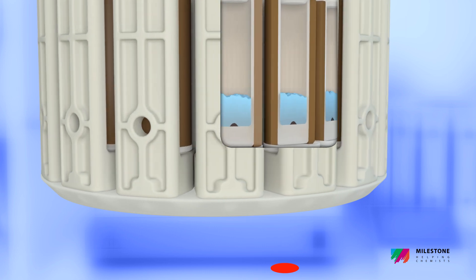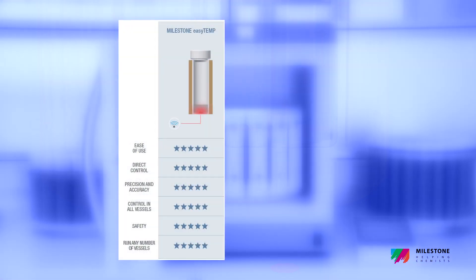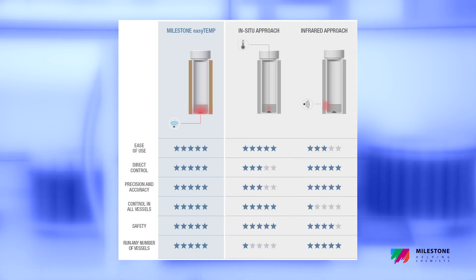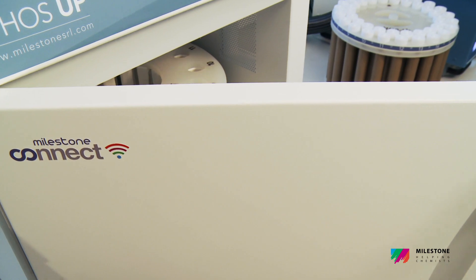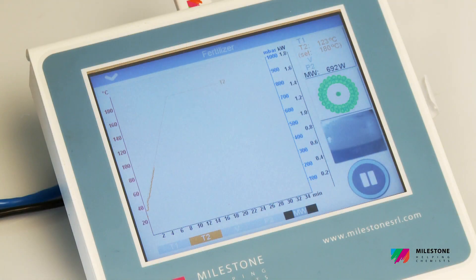EasyTemp technology combines the fast and accurate reading of an in-situ temperature sensor with the flexibility of an infrared sensor, which along with the Ethos Up software provides digestion traceability and temperature measurement for every sample. The temperature diagram and profiles are displayed in real-time and then saved on the Ethos Up terminal.